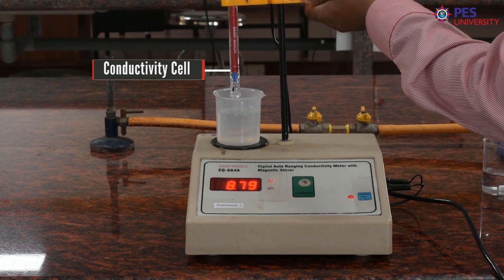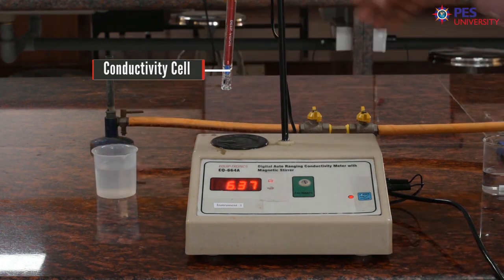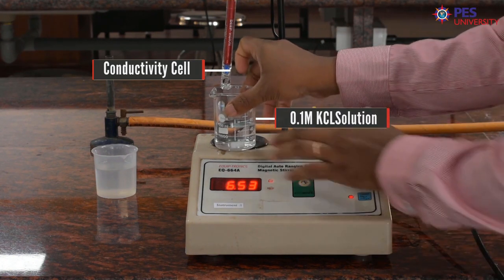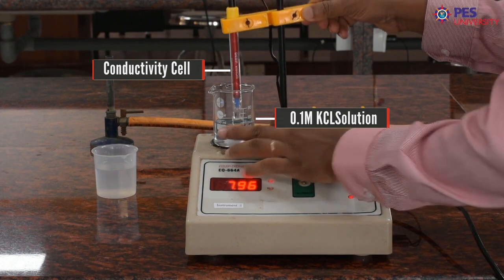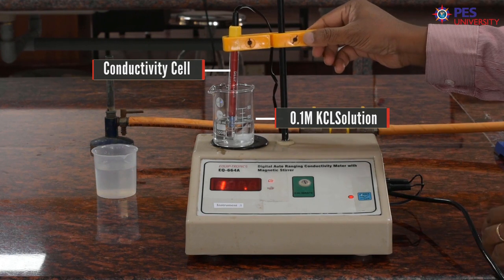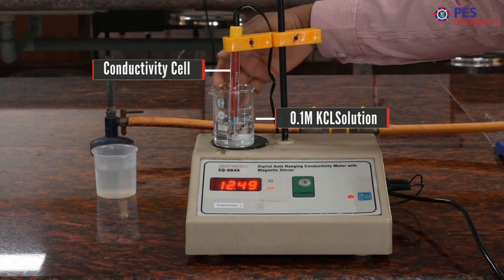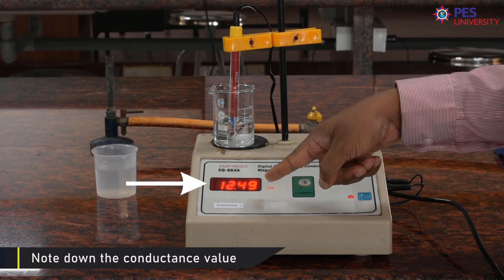After rinsing the electrode, take 0.1 molar KCl solution and immerse this conductivity cell inside the solution and make sure that both the platinum electrodes are completely immersed inside the solution. Then note down the conductance value.